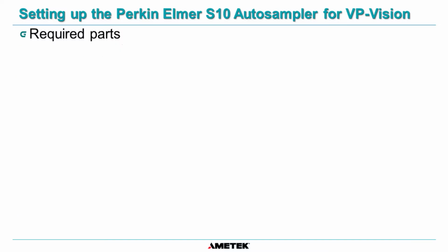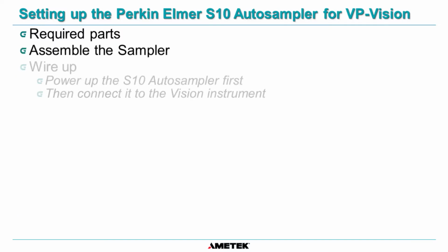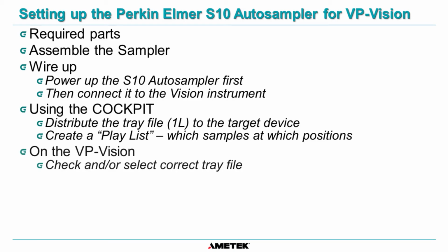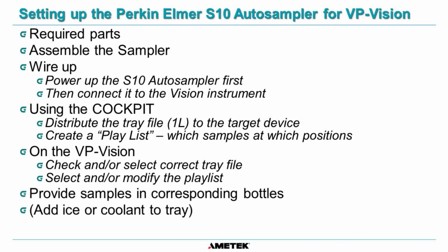We will cover the required parts, how to put them together and wire them up. We use the cockpit to create a playlist, then set up and check it on the instrument. In the next step, we provide the samples and finally start the measurement.